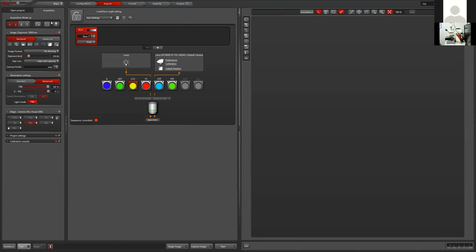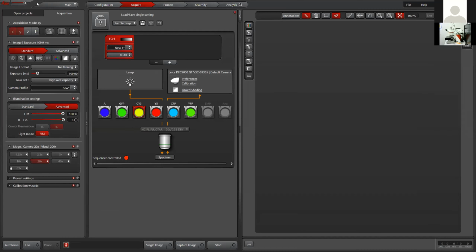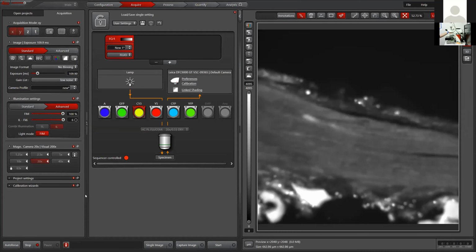I don't know if you guys can see it. I'm gonna turn the font a little bigger. Okay. So this camera, I will just switch here to low noise, which means high sensitivity. And let's see if I can get any signal on there. Well, I guess I can. Let me turn the room lights off and make it a little more in focus.